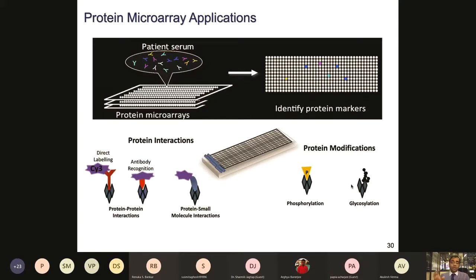There is already a possibility of having glycosylation, but you need to do those experiments separately, whether the assay condition is favoring the PTM modifications or not. And if that is the case, then you can apply the same on the miniaturized array format. So I hope you're at least gaining some more familiarity of using a new technology which can be utilized for your different projects for protein array-based applications.